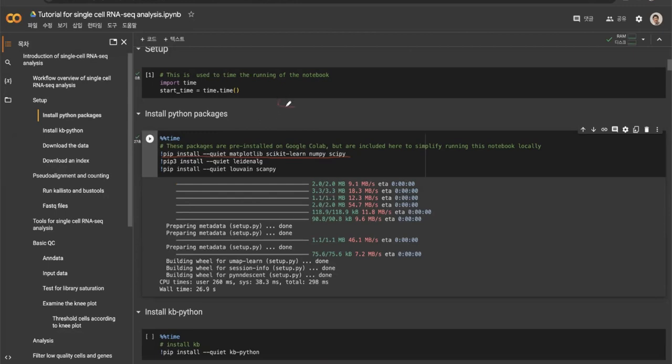Because this is you, right? And you are using some notebook, my amazing artistic drawing, right? So this is your notebook. So you type this one, you're not going to install the package on your notebook. Rather, you install the package somewhere in the cloud. This is not literally a cloud.